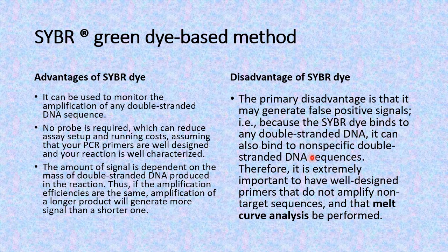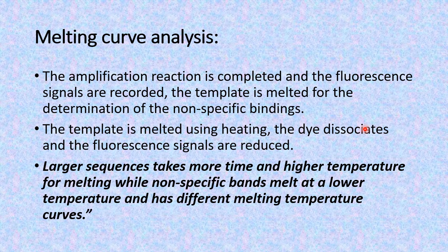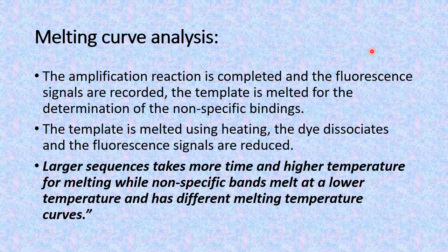The primary disadvantage of this system is that it may produce false positive signals, because it can bind to any double-stranded DNA — even to non-specific double-stranded sequences. In order to mitigate this disadvantage, melt curve analysis is performed. In melt curve analysis, the amplification reaction is completed and the fluorescence signals are recorded — meaning all the amplicons in the system are in the form of a duplex molecule. For melt curve analysis, the templates are again denatured, because the objective is to determine the non-specific bindings of this dye.